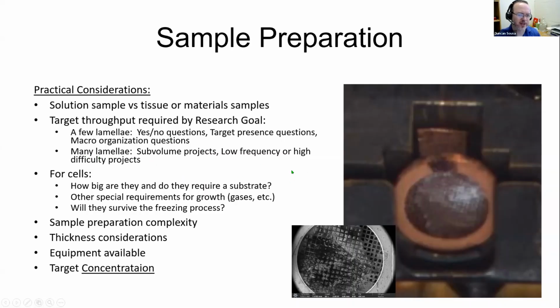You're just screening. You want to know, can you find something in your sample? And you may need 100 to go through to see, like, okay, it's only 1%. 1% is still a lot, but I need to look at a whole bunch because maybe its population is not great in the material.